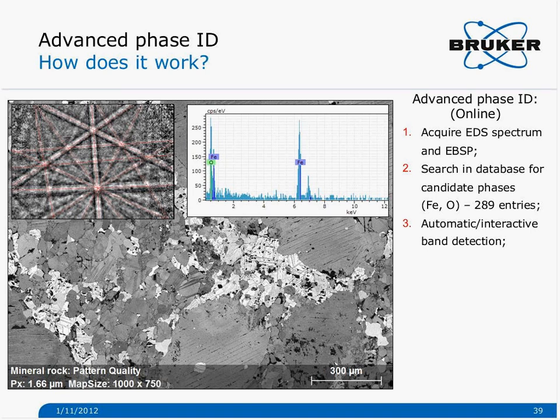And on the pattern, you see in red the band centers of the detected bands.